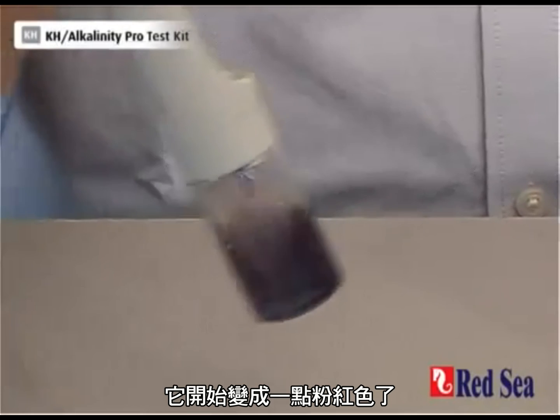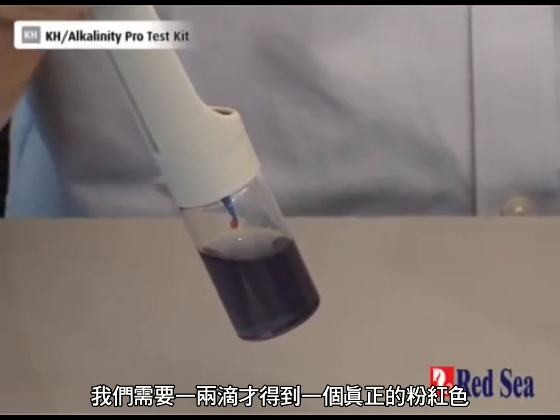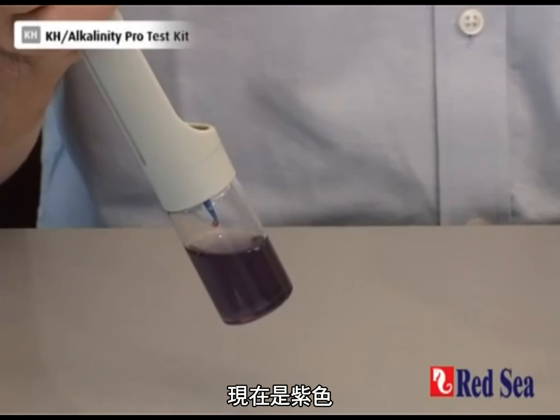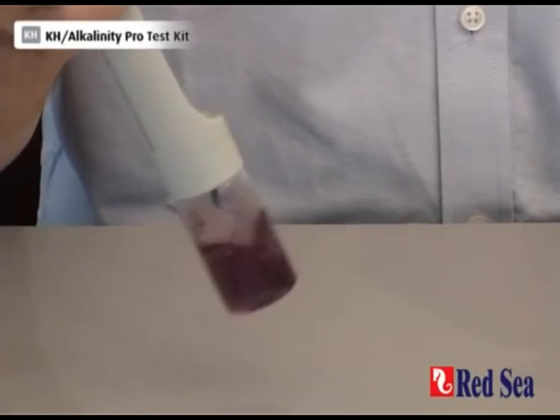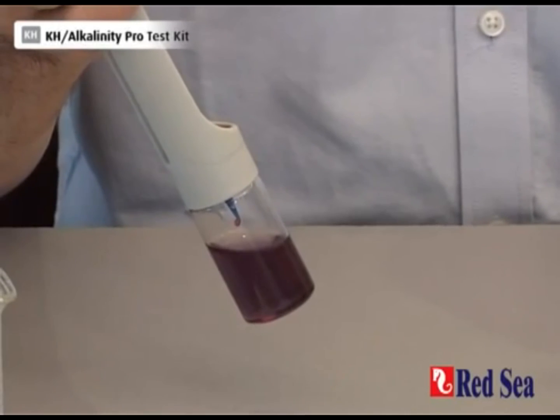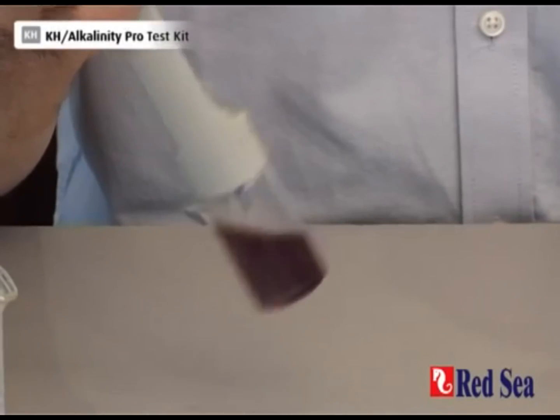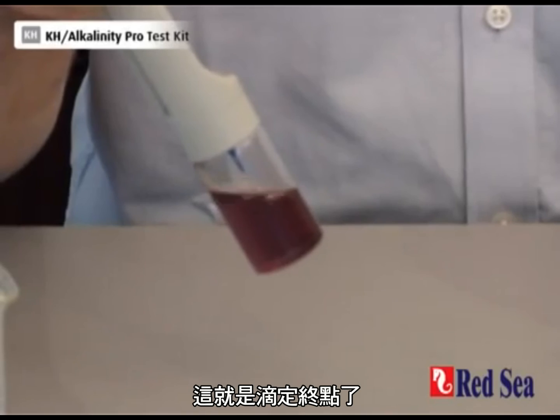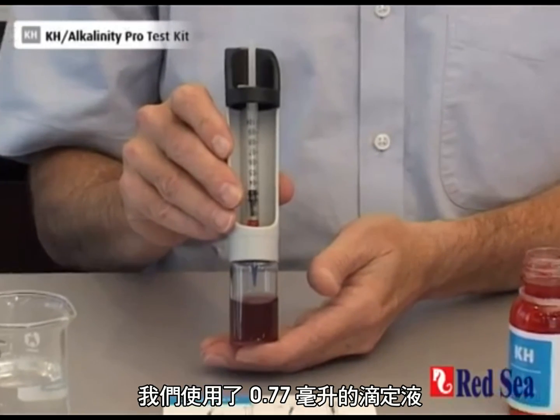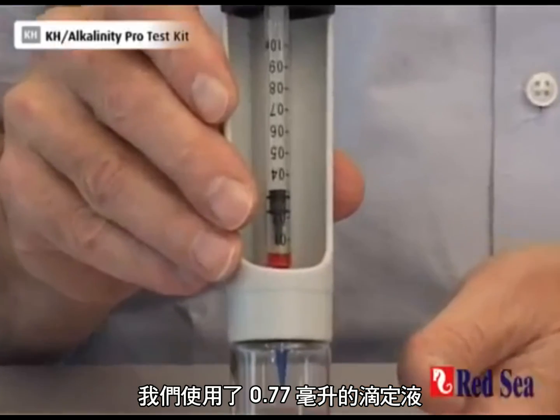It's beginning to get a little bit pink and we're looking for a good pink. We'll be there in a couple more drops. And one more drop. We are there at the end point. I look at the syringe and I can now see that I've used 0.77 ml of titrant.